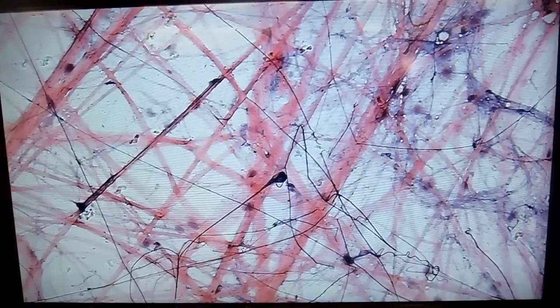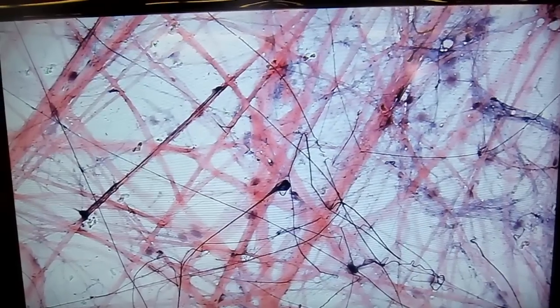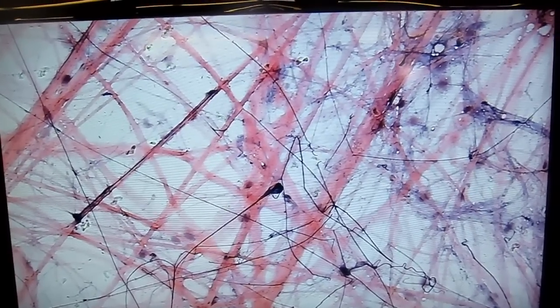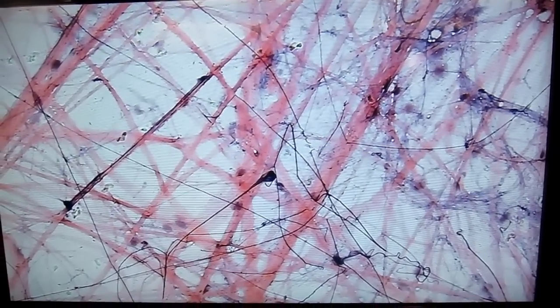And remember, if a tissue is a loose connective tissue, it's loose because it doesn't have a high density of fibers. Now, looking at this tissue, you may say, well, I see a lot of fibers here.